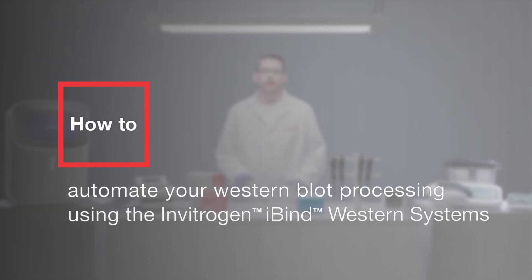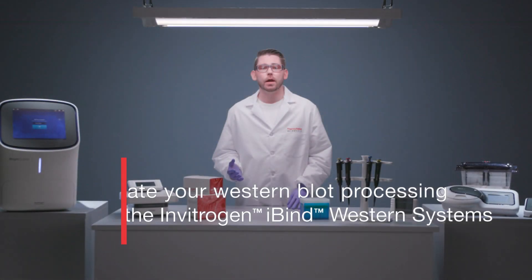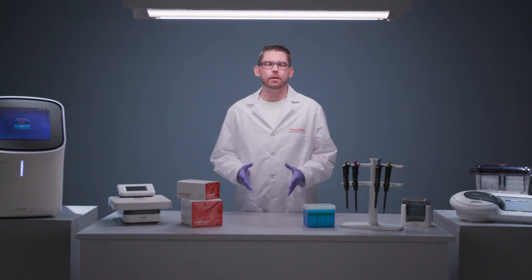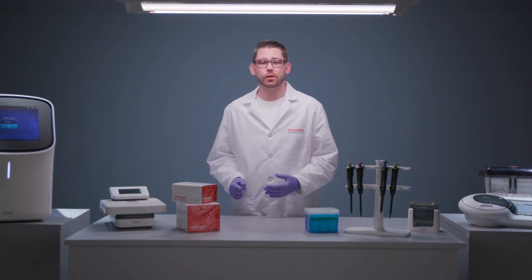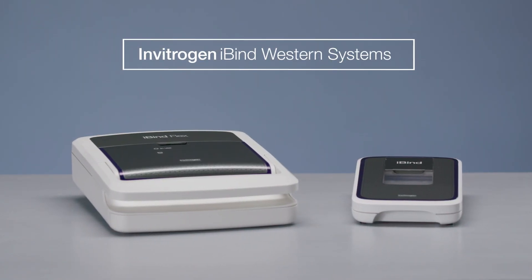After Western blot transfer, the membrane is ready to be probed for your protein or proteins of interest. Traditionally, this has been a manual process that involves incubating the blot in a series of antibody and wash solutions in a tray over several hours. Invitrogen iBind Western Systems are non-powered automated Western processing devices that allow all solutions to be prepared and loaded in the device at the start of the procedure, from which point all steps proceed automatically and uninterrupted by sequential lateral flow technology.